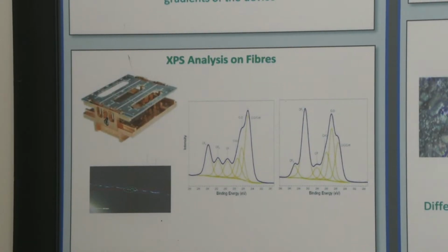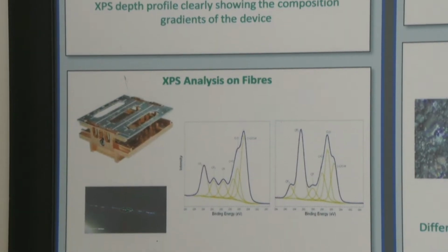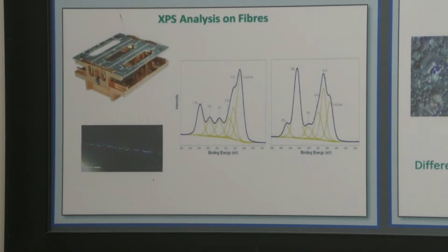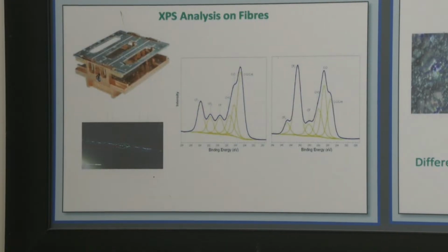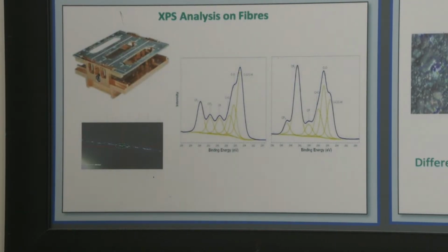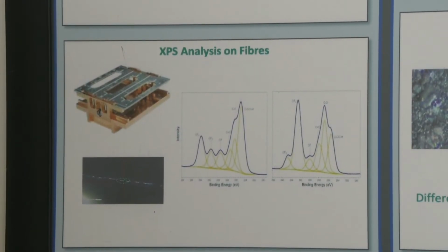We also have the mapping options. It is like a Raman mapping or the FESEM EDX mapping. Similar to that, how the elements are distributed can be mapped, and that mapped image can be generated. For any composite material you have, how it is distributed can be mapped, and you can get the mapping images also. And these are the failure analysis for some other applications.